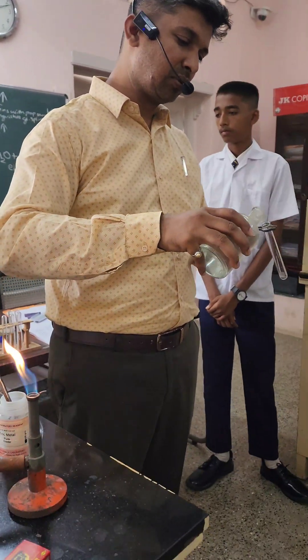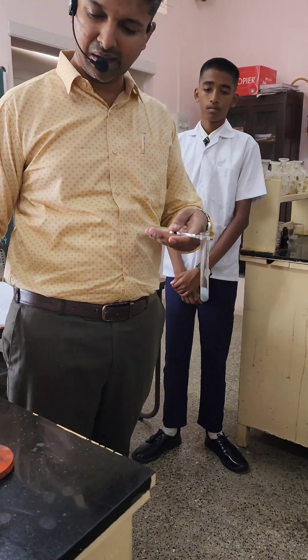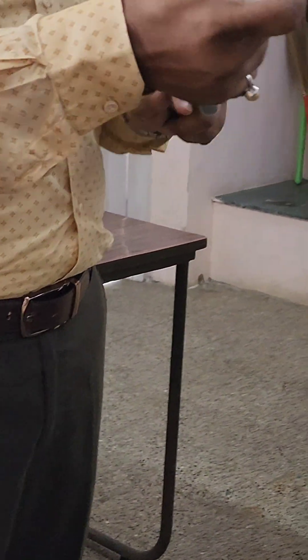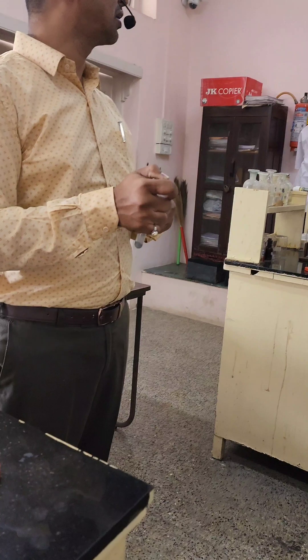We are adding dilute HCl to granulated or powdered zinc. Can you see those bubbles coming up? I will close the mouth of the test tube — why? In order to entrap the hydrogen gas. And because it is dilute HCl, I can use my finger — nothing will happen. Why? Because it is not concentrated HCl.